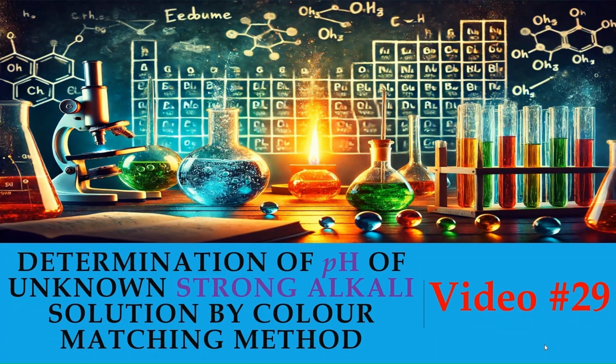In this video, I'll discuss a physical chemistry practical experiment. The title of the experiment is Determination of pH of unknown strong alkali solution by color matching method.